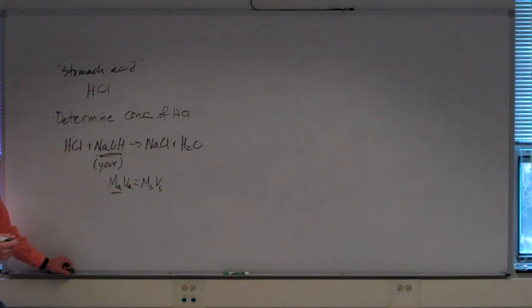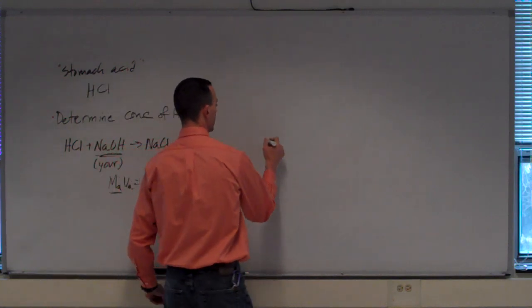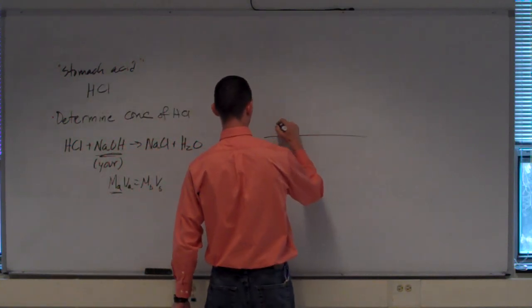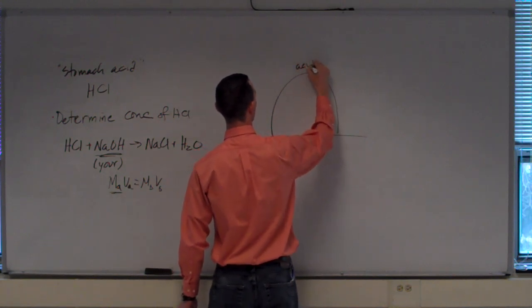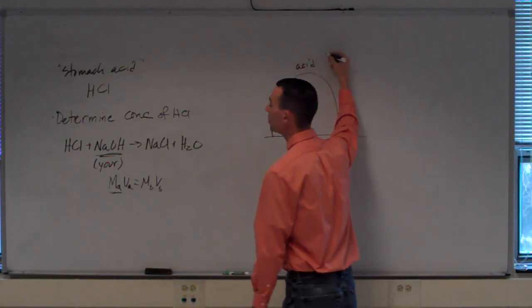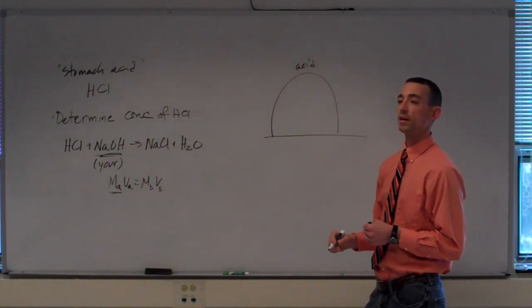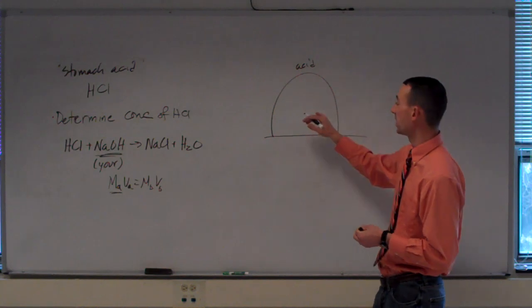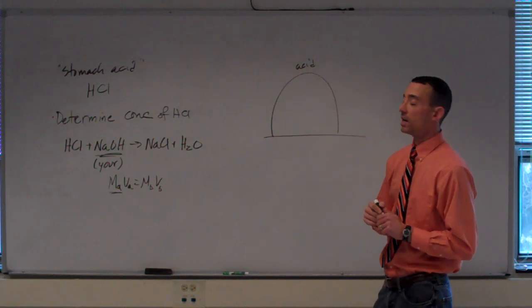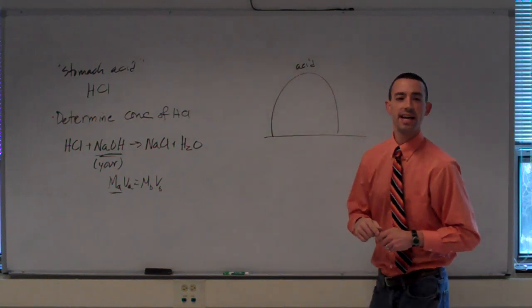Okay? Once you know the molarity of the acid, you will basically create a big pile of acid molecules. This will be generated by having, I believe, 3 aliquots, or 3 25 milliliter pipettes of the hydrochloric acid. Now we're going to eliminate or react all of this acid.